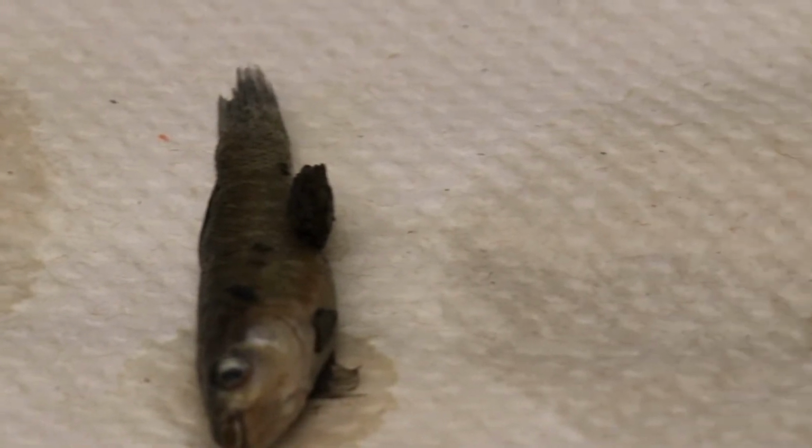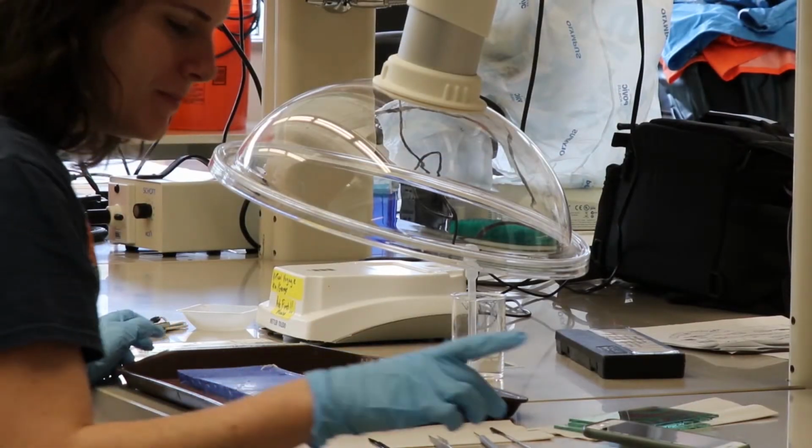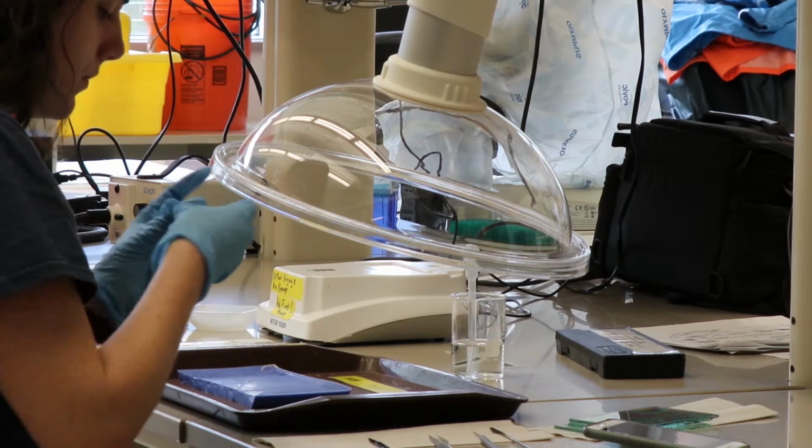within the Rhode River. The fish are collected in the field by another lab at SERC, and they'll bring us bags of around 30 fish for the different sites. And currently I believe I have 9 or 10 different locations in the Rhode River. Once I get the fish, I'll remove them from the freezer and go through the steps to remove the different organs and scan for parasites.